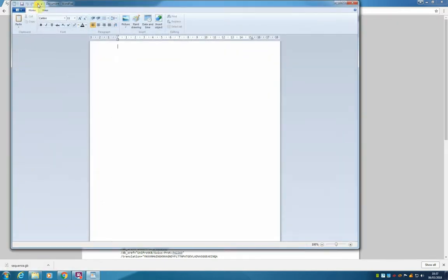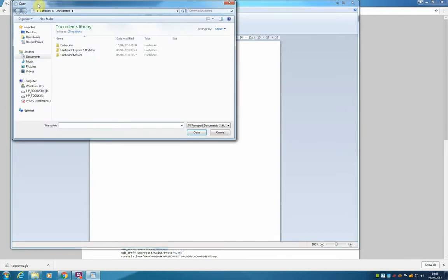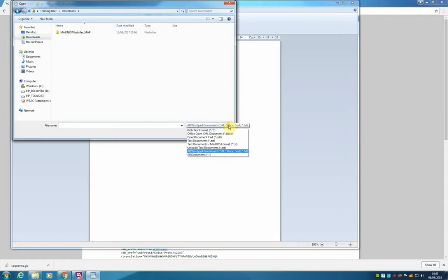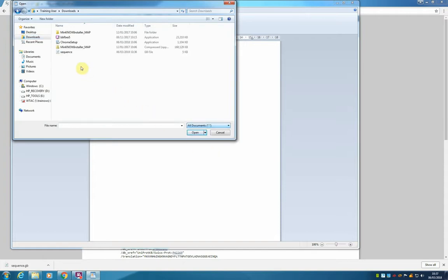And from here I am going to open the file directly from the downloads folder. Notice that the file does not appear in the list, this is because the extension is not necessarily compatible with WordPad, but we can choose to show all documents, and here is our sequence.